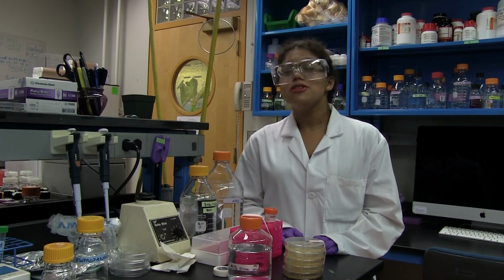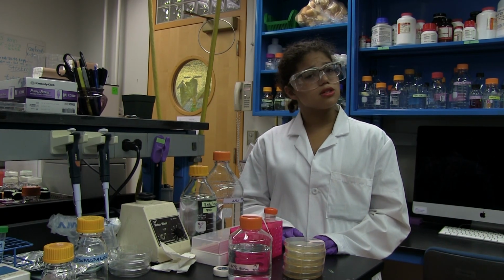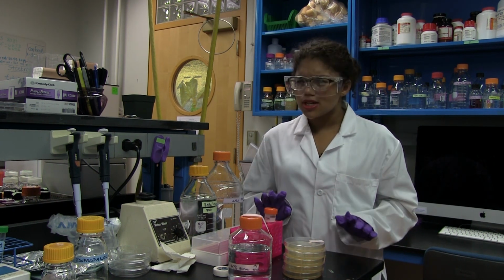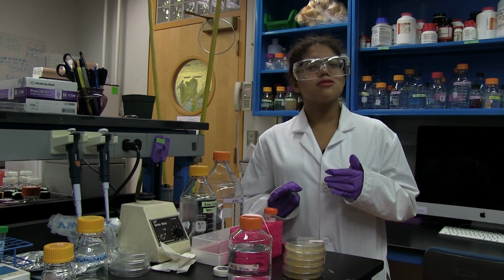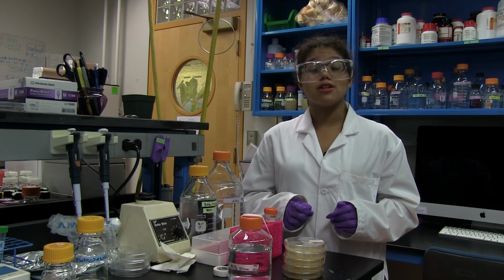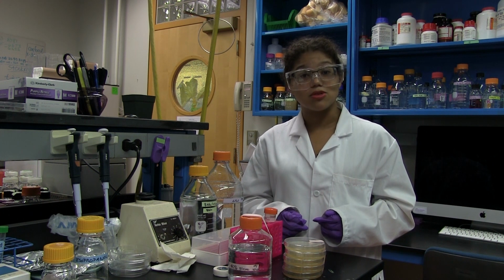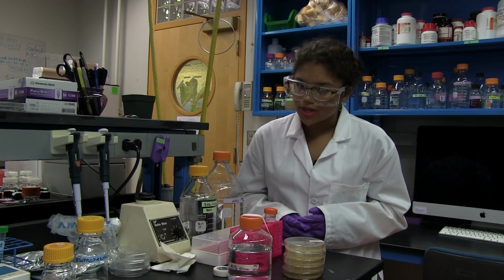Great job, Wendy. You used RAMP wonderfully. Your analysis and mitigation were especially successful because of your background knowledge. However, while it's pretty easy to infer that an alligator is dangerous, lab hazards are a little more tricky. Luckily for us, OSHA has provided us with a globally harmonized system for classifying hazardous chemicals, which does a lot of the assessment beforehand.